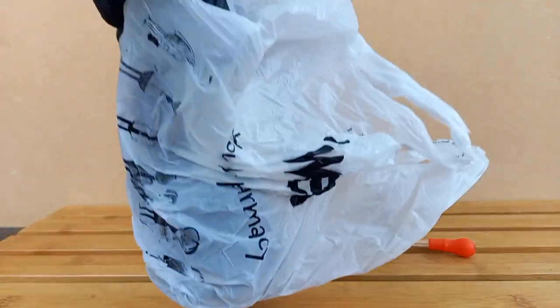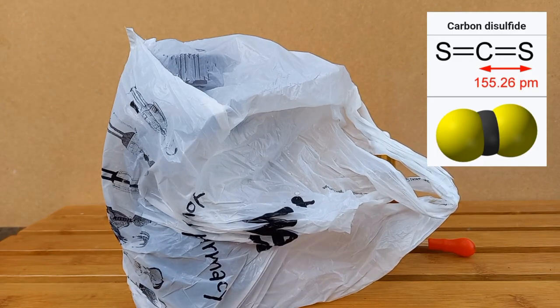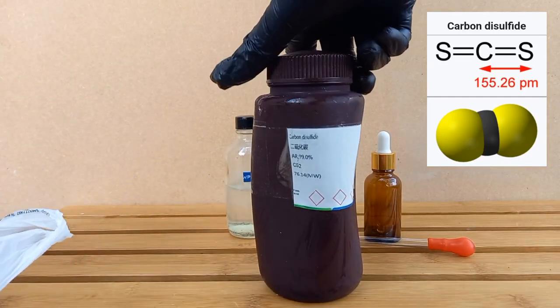Here is the carbon disulfide, which I've been keeping in the freezer due to its low boiling point.